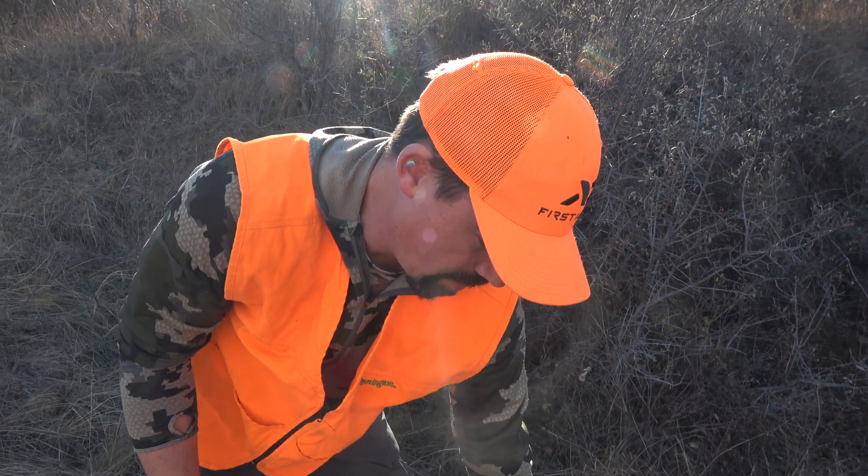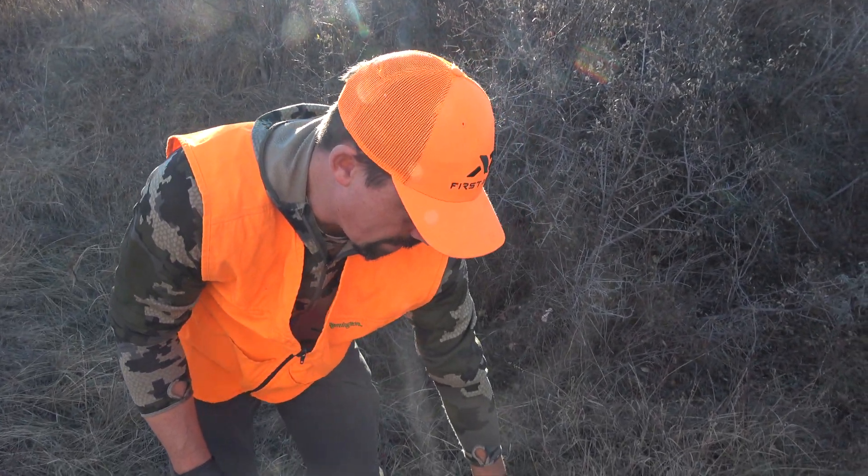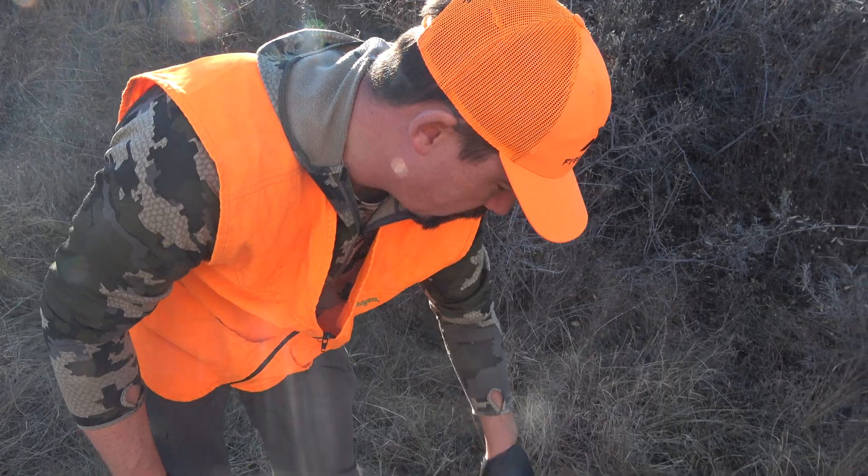We just got done skinning out the head, so now we're going to get the lymph nodes out. There are two of them, one on each side, and we're going to save those so we can get this deer tested for CWD so the Game and Fish can keep track of all that data and make sure it's a nice healthy deer.